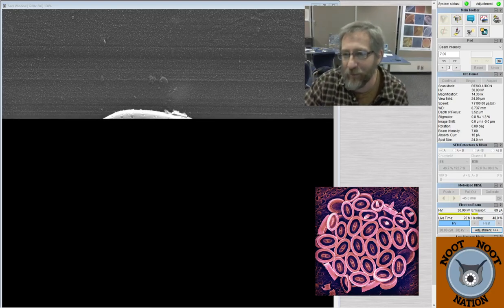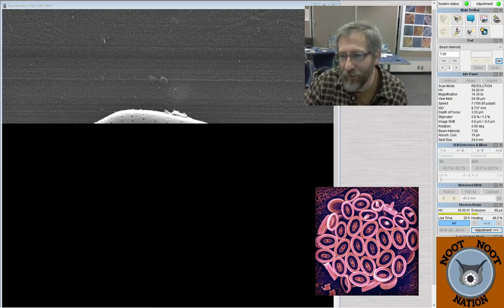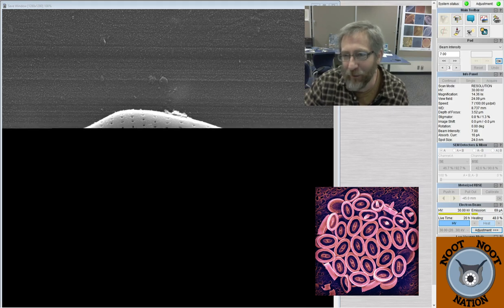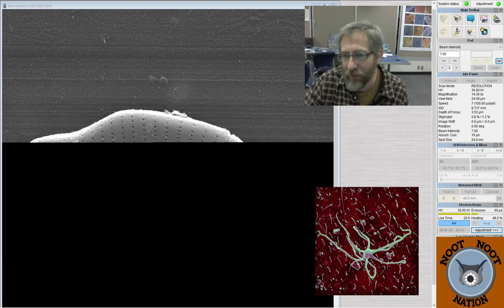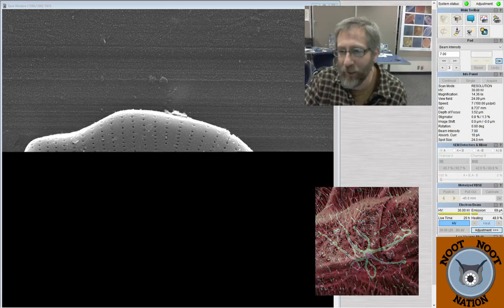Do they stick somewhere or float free? I think they stick in the sediment. I don't think they float. Nice view. It's hard to understand how small it is. Oh, 2 microns. Yeah, they're very small. It's got a lot of little windows in its house. Yeah, it's a good way of thinking about it. Endless. I don't know why the little holes are there. I'm not sure.